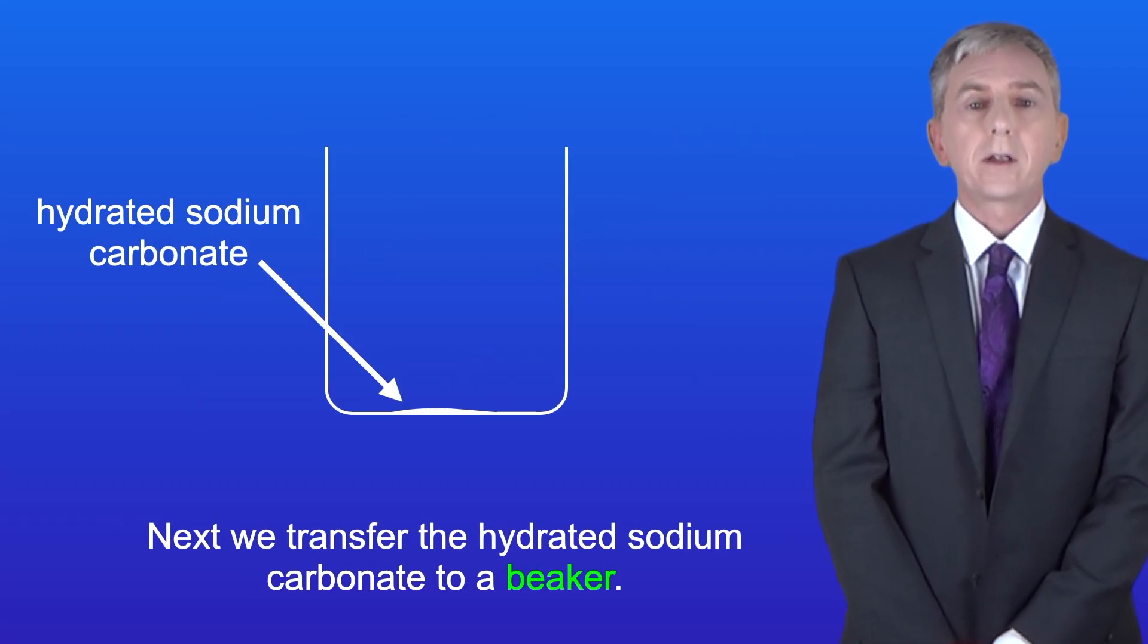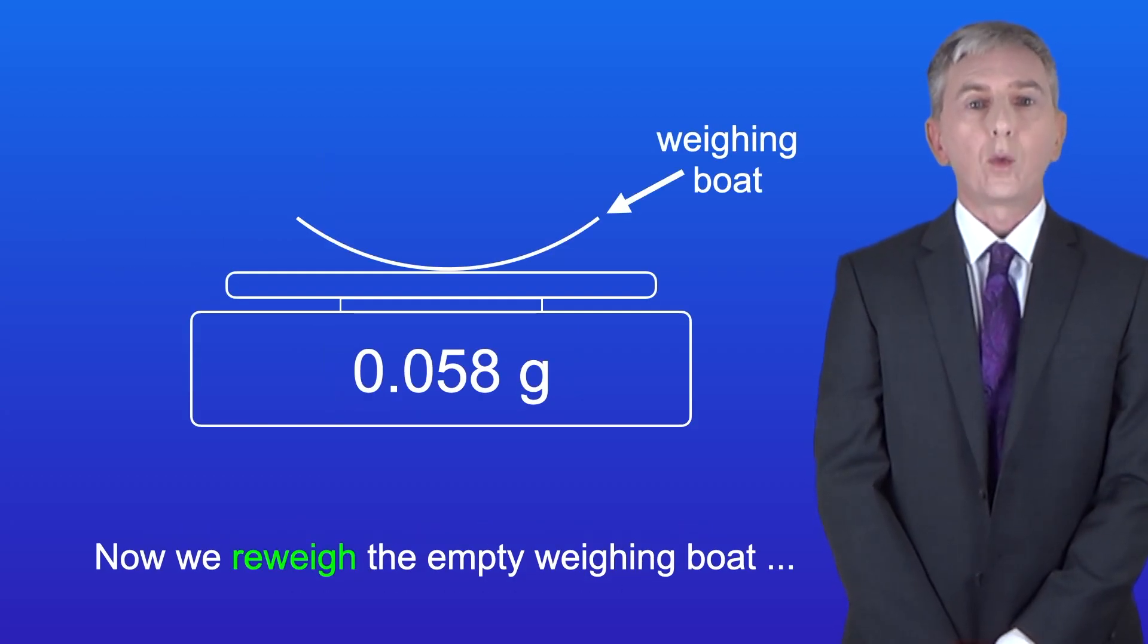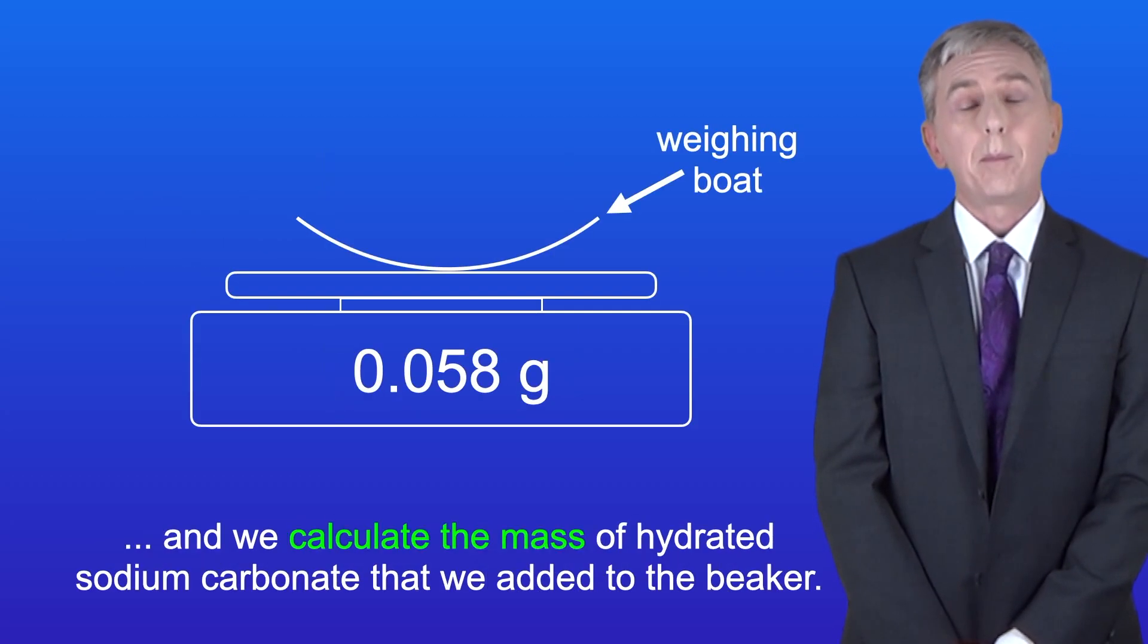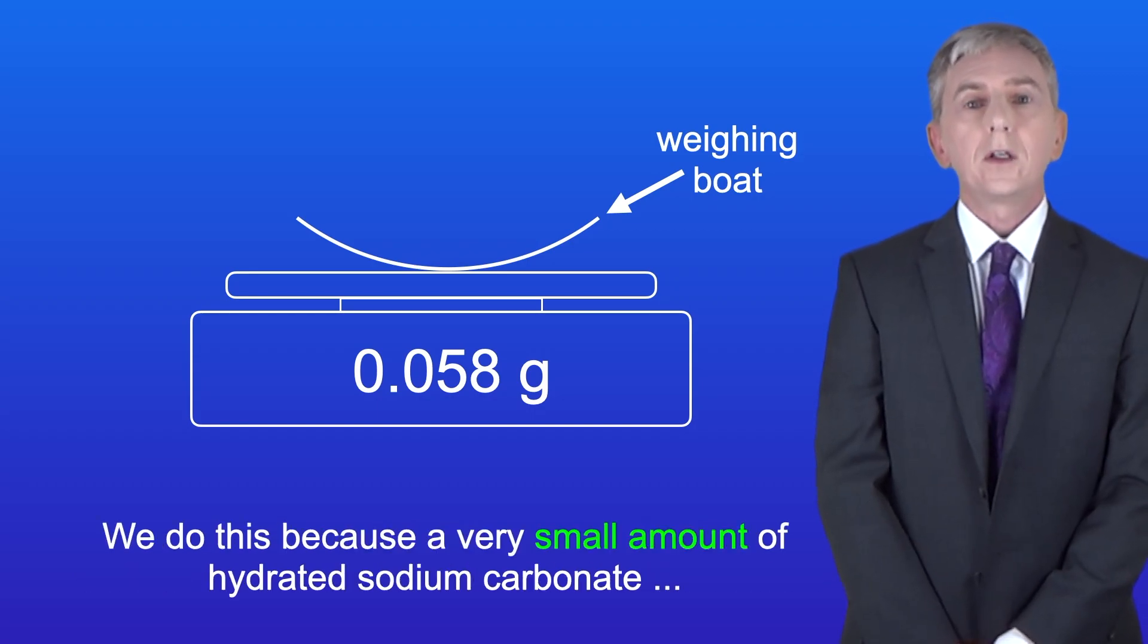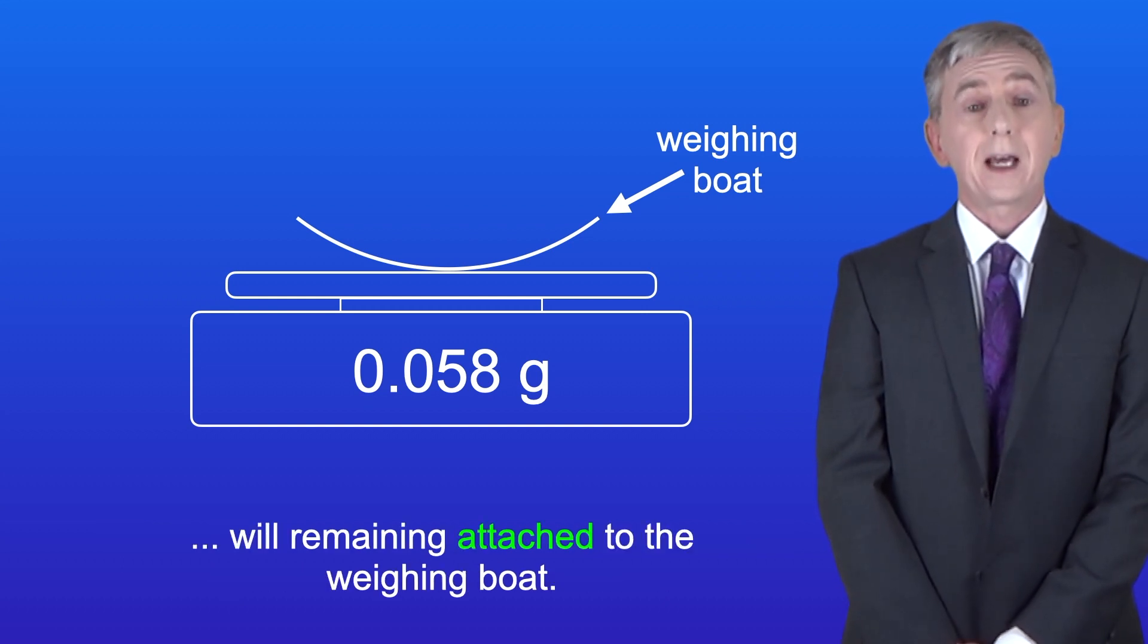Next, we transfer the hydrated sodium carbonate to a beaker. Now we re-weigh the empty weighing boat, and we calculate the mass of hydrated sodium carbonate that we added to the beaker. We do this because a very small amount of hydrated sodium carbonate will remain attached to the weighing boat.